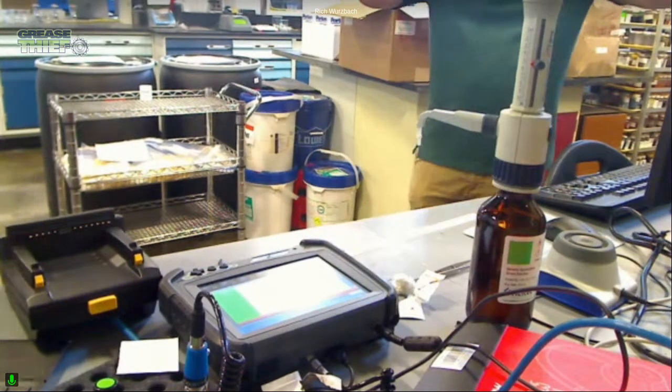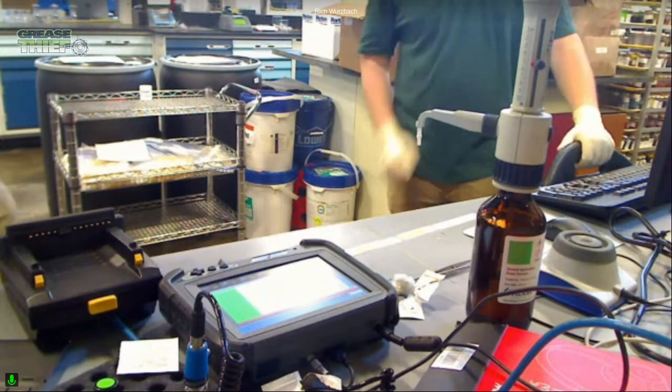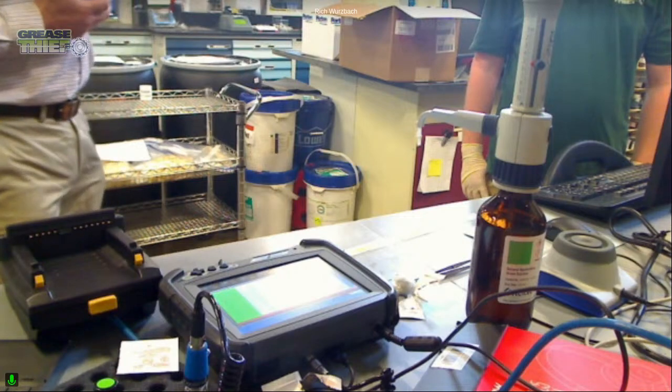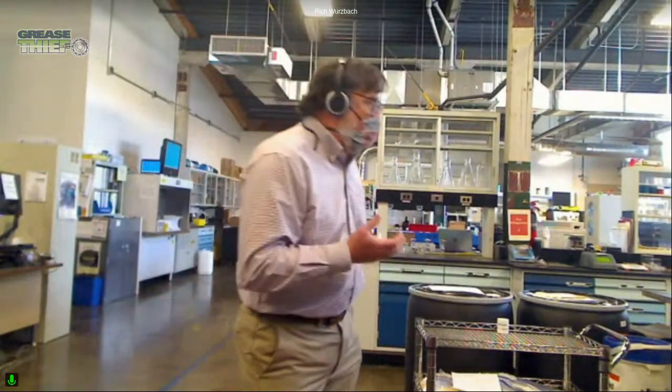And that was a helpful demonstration to see what the process is. But I think what we see in practice is that some greases will really dissolve very well on that substrate when you're using the grease thief analyzer to prepare the grease sample in that consistent manner each time. But of course, some greases are going to be aged, or they're going to have contaminants in them, and they may not dissolve as well. Or there may be different chemistries where it's really not optimized to the condition of that particular grease, or really the chemistry of that particular grease.